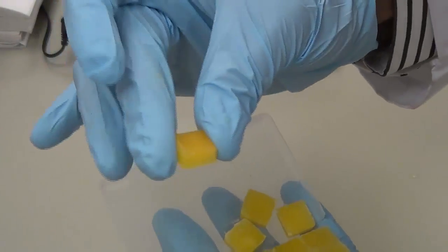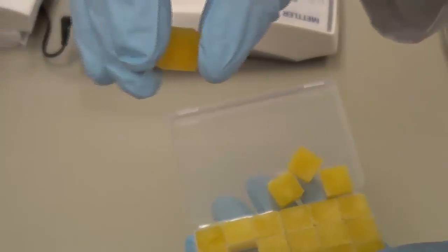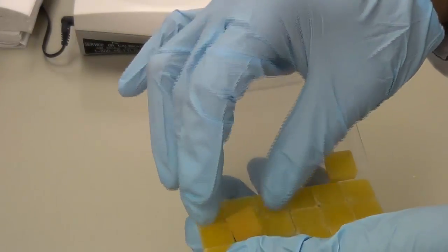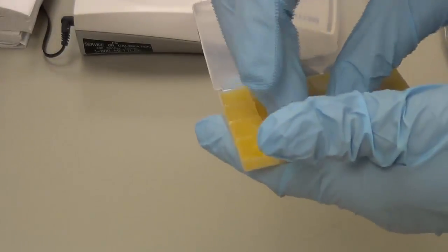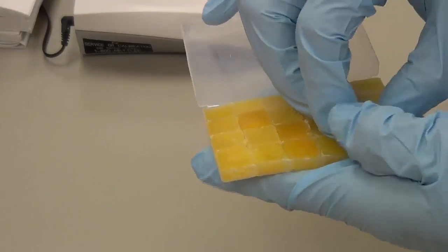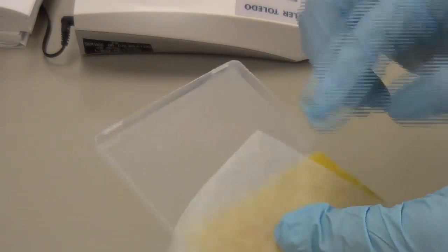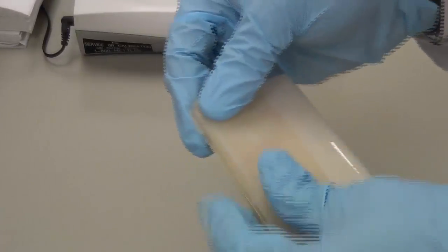After that, take off all your troches, weigh them, take an average weight and find out the percentage error, and flip the troches upside down. The smooth one will be flipped back and will be facing the top. Flip all of them like this and place them. You can use a wax paper, because you want to make sure it's not going to stick back to the lid. Use a wax paper like this, close it, and dispense it using a proper label. That's it.